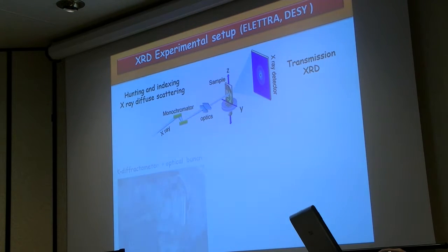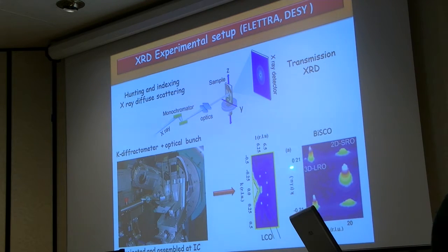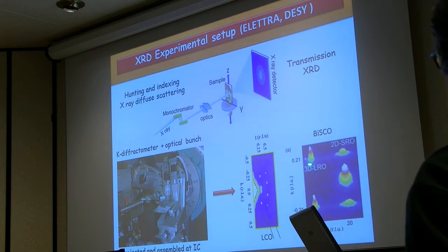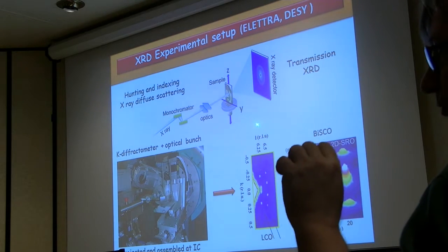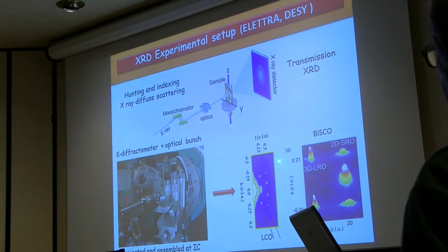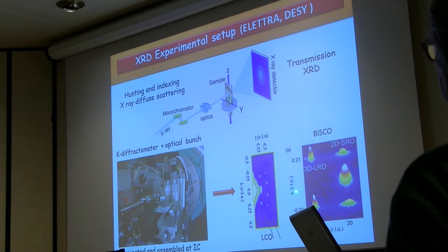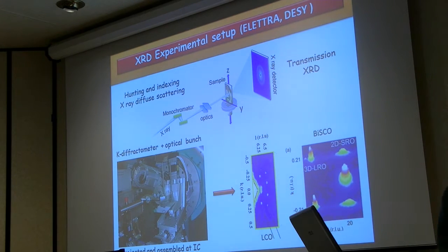What we do is basically explore the reciprocal space, because we no longer need to measure only the Bragg peak, but we need a deeper investigation and exploration of reciprocal space, getting this kind of strange feature, associating them to, for example, oxygen interstitial dopants, or whatever, or electron ordering or spin density ordering.